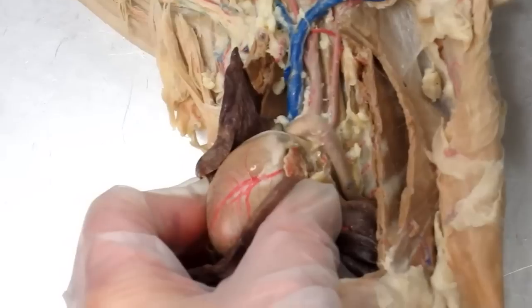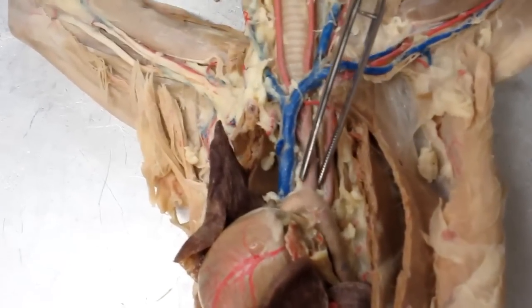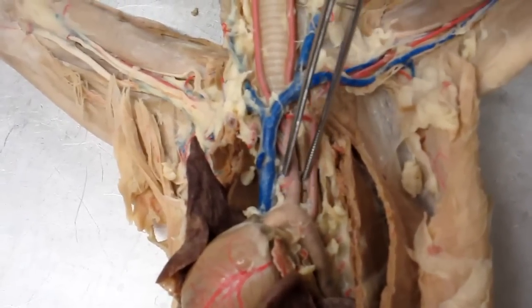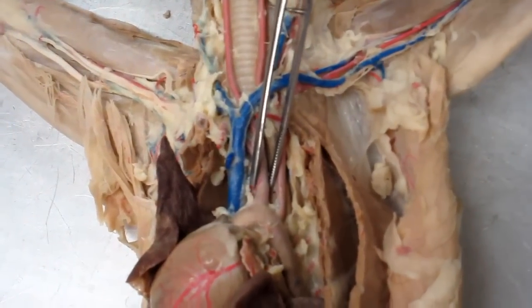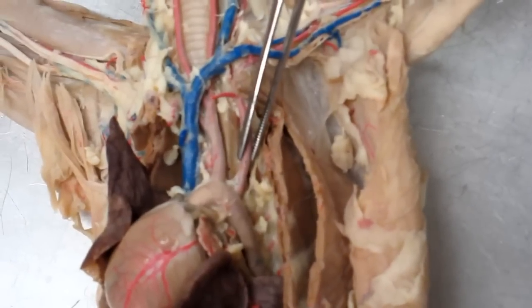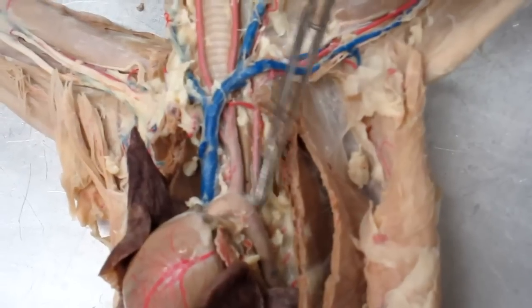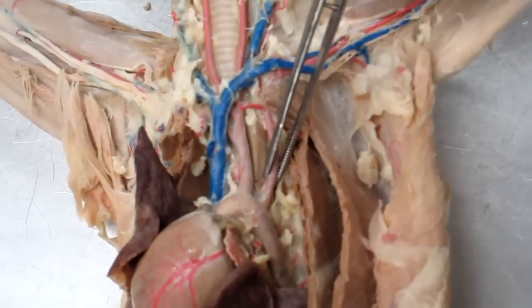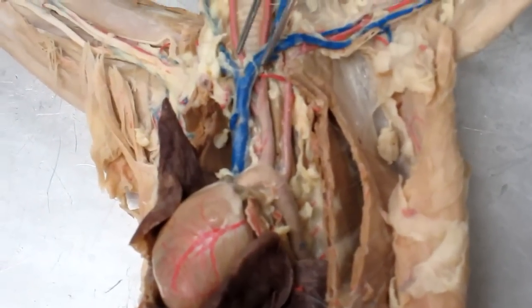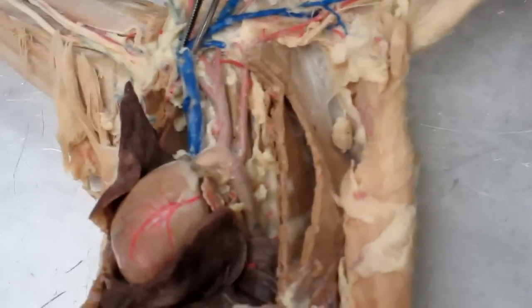Okay. Now on the cat, unlike in humans, there are only two branches that come off of the aortic arch. The large branch is the brachiocephalic artery. The small branch is the left subclavian artery. Okay, so unlike in humans where we have also the left common carotid, we only have these two branches on the cat aortic arch.